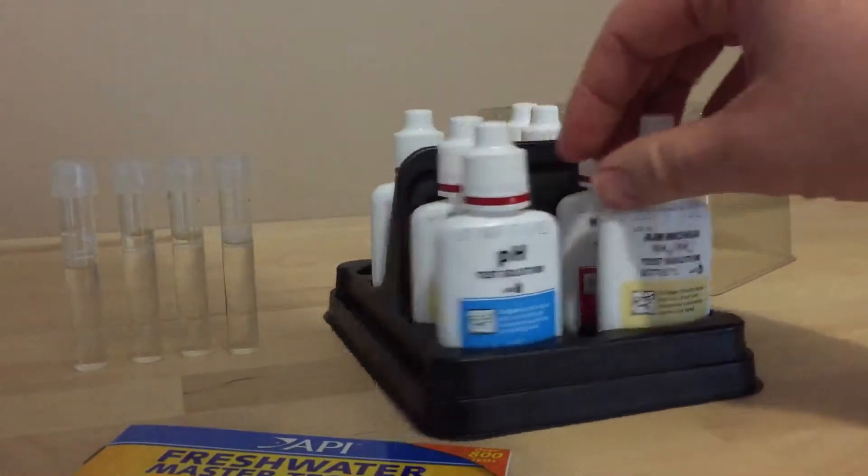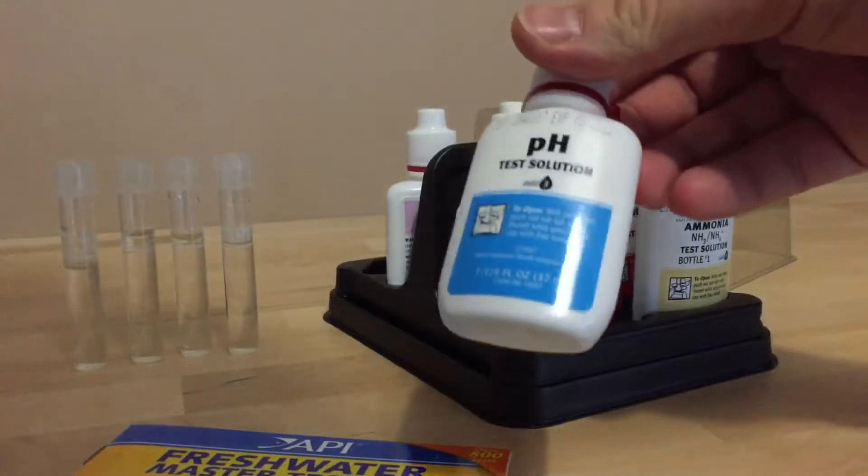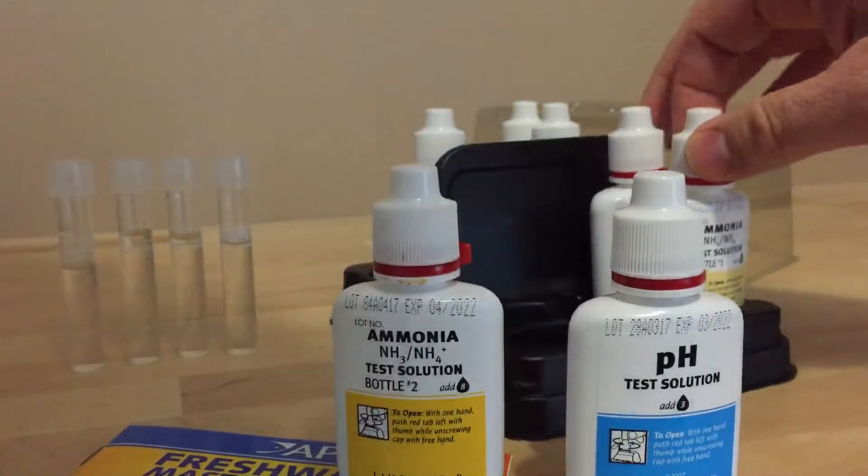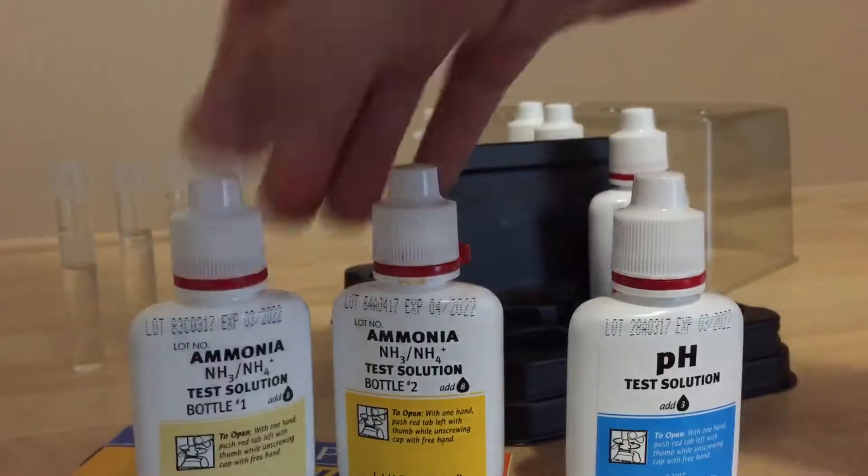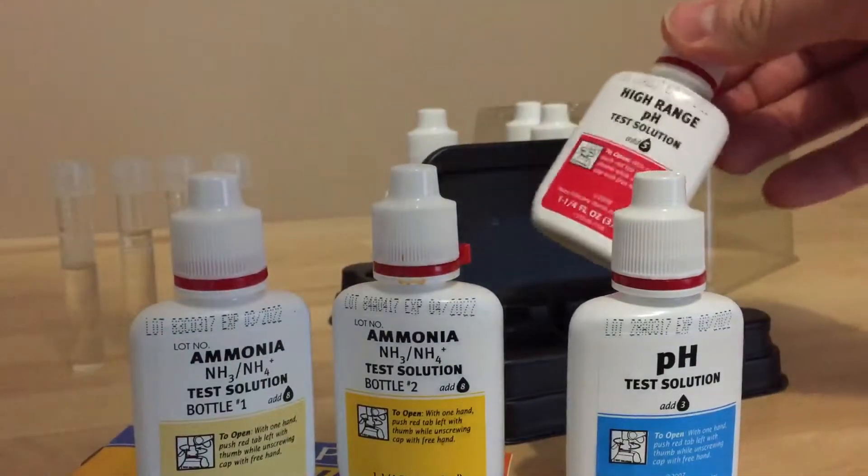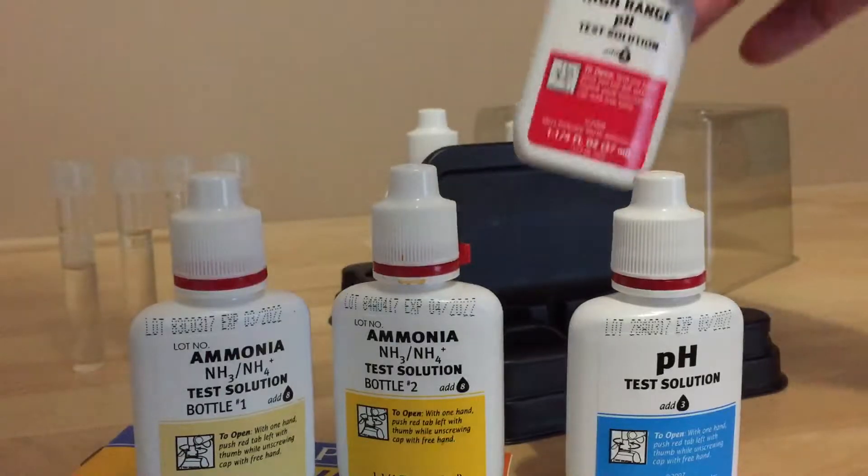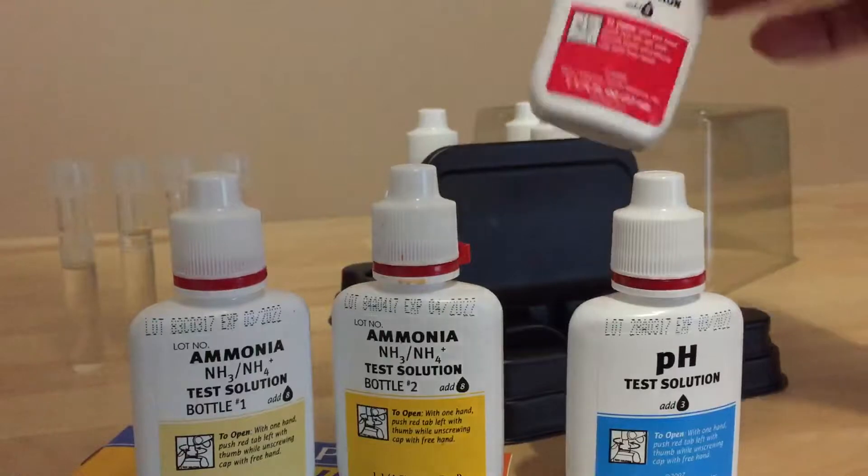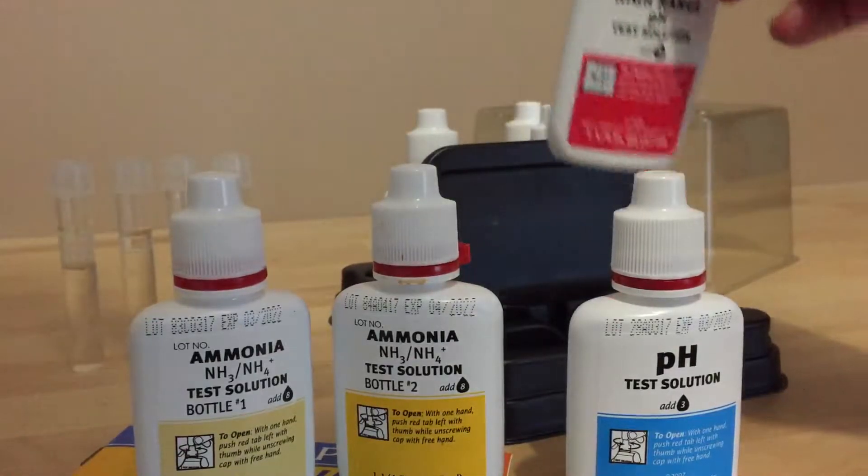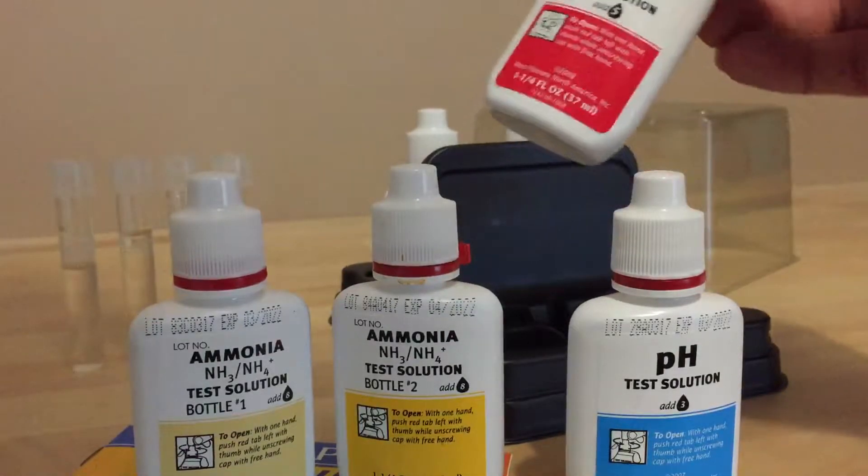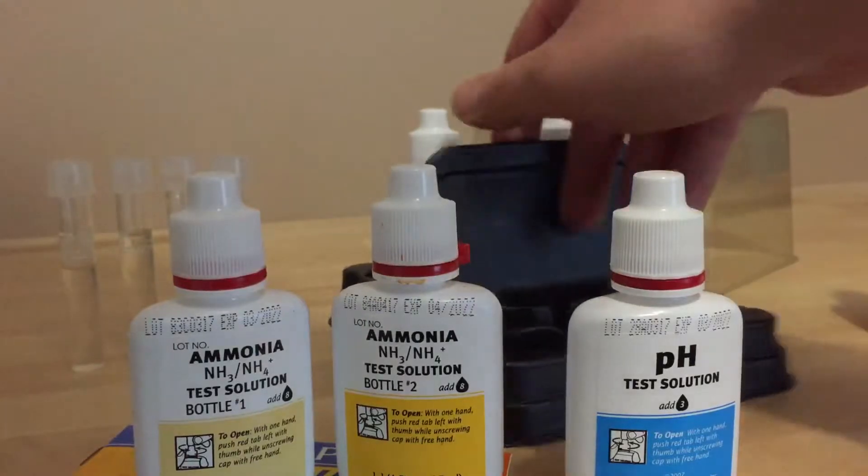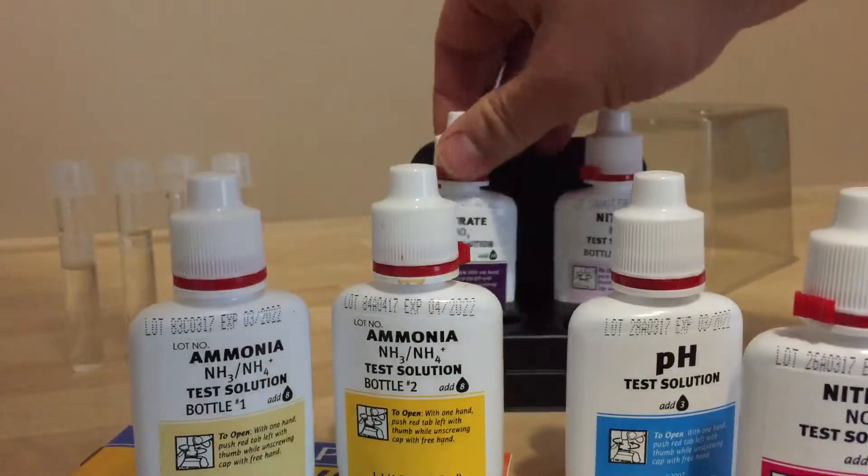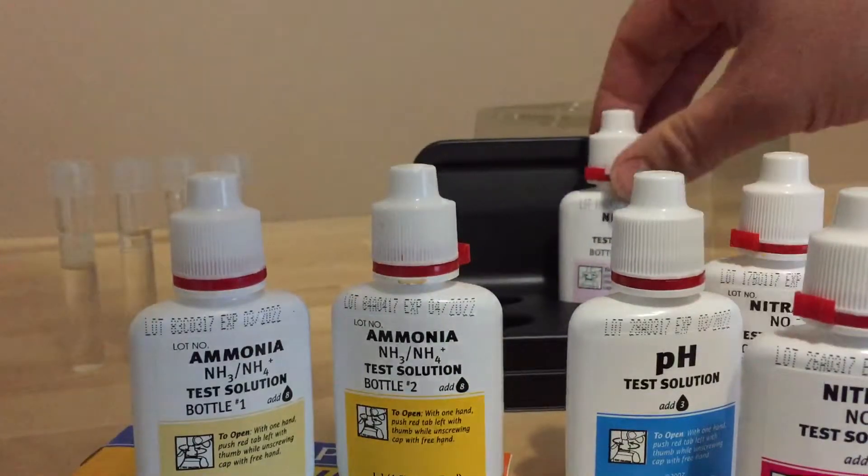These kits have everything: you have tests for pH, there's ammonia which actually has two bottles for the test, there is a high pH range test. Some fish require a higher pH. The tank I'm cycling at the minute, in fact none of the tanks I have, I would use this for, but some fish do require this and it's there if you need it.